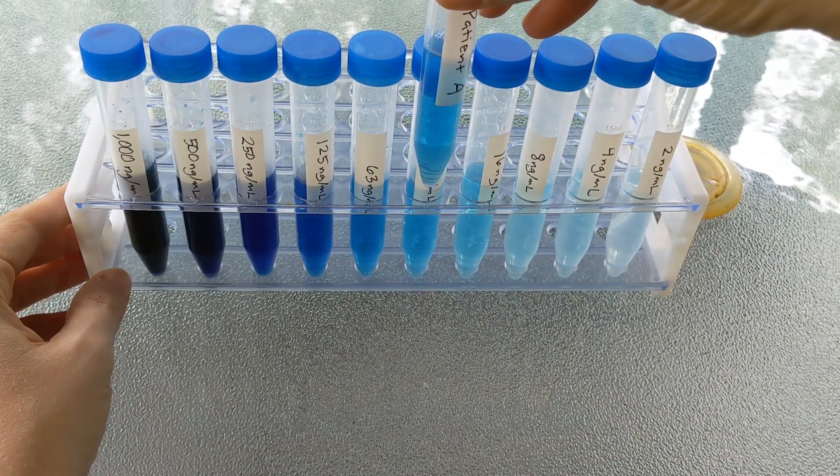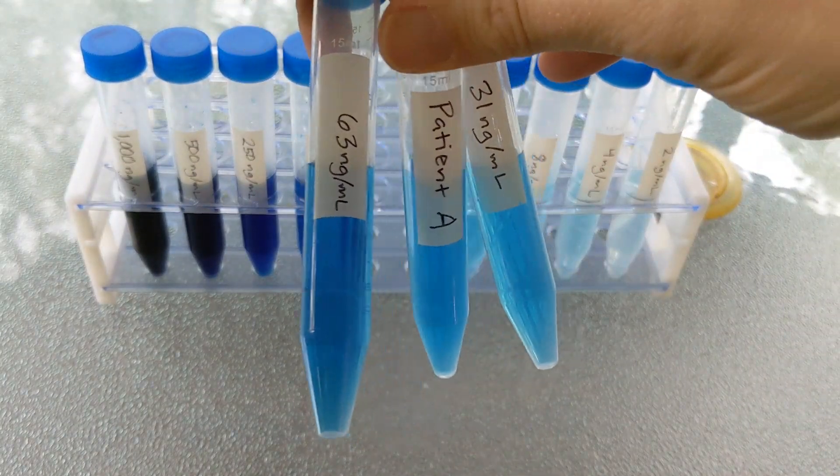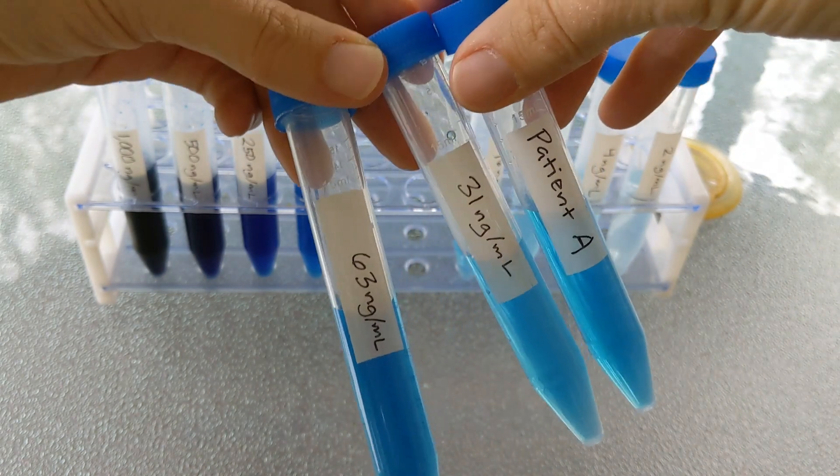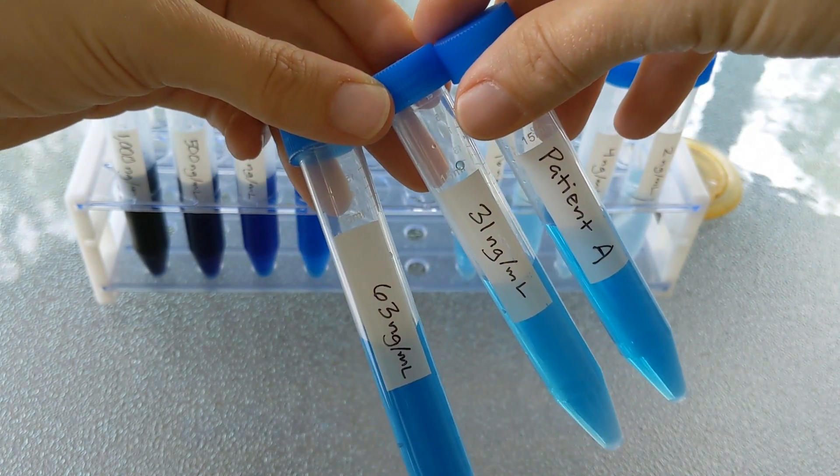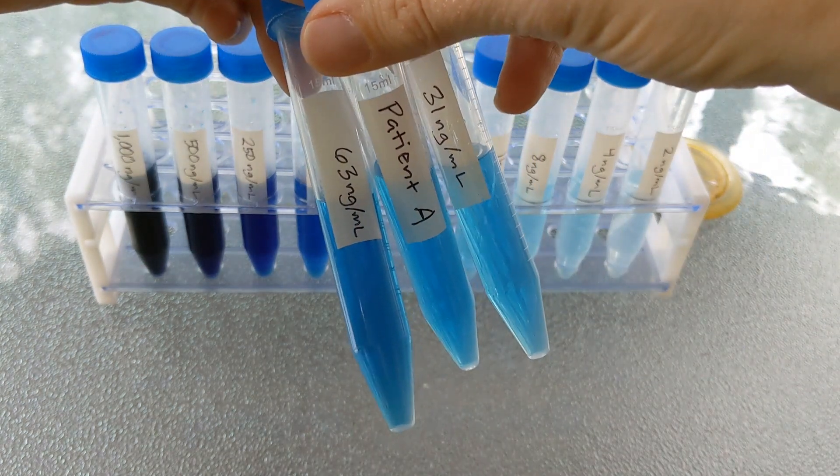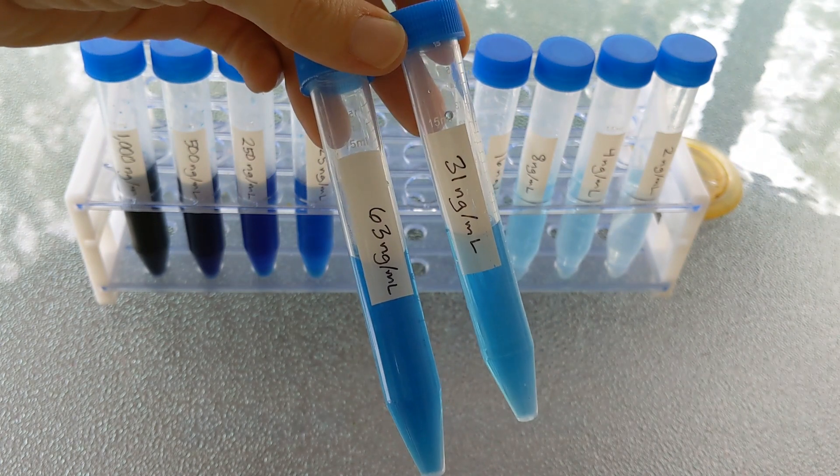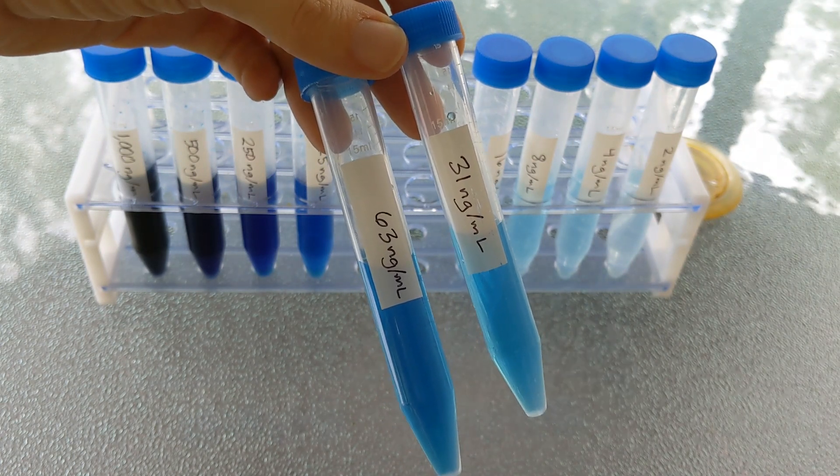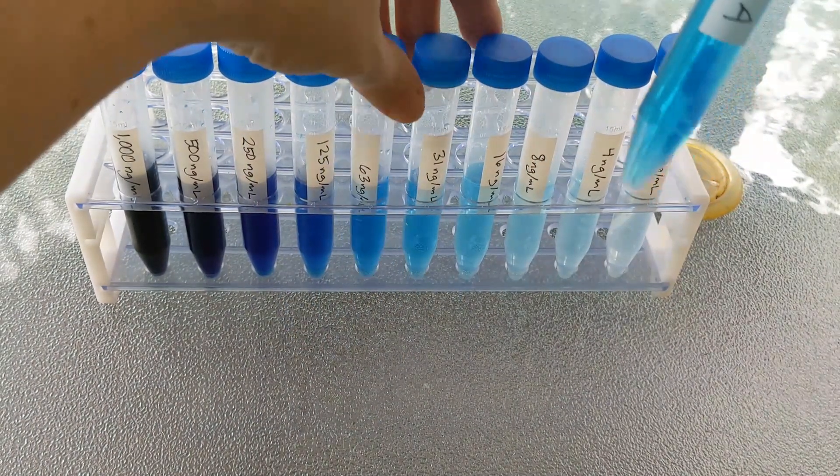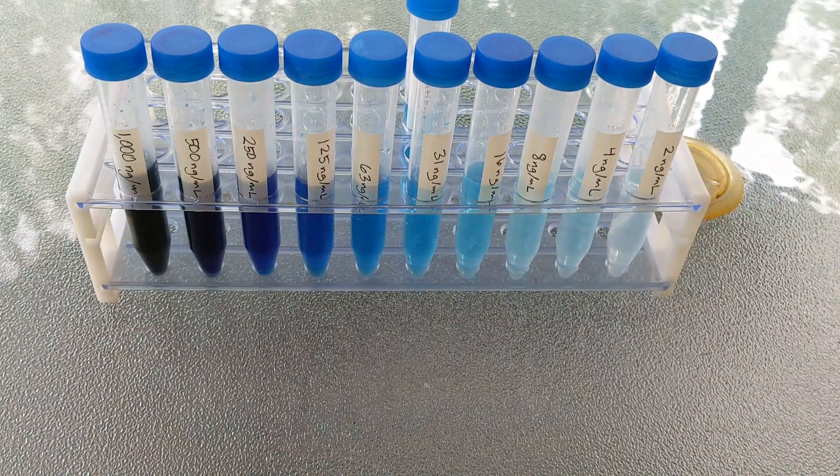And it can be kind of tricky, but I'd say it's maybe between these two. To me, that one looks a little bit more like this. So I'm going to call patient A 31 nanograms per milliliter. If you thought it was right between the two, you could even estimate in between. So you could average 31 and 63. It's going to be somewhere around 46 would be my guess. So that's the first patient. I'm going to line it up right here behind 31 because that's what I think it matches.